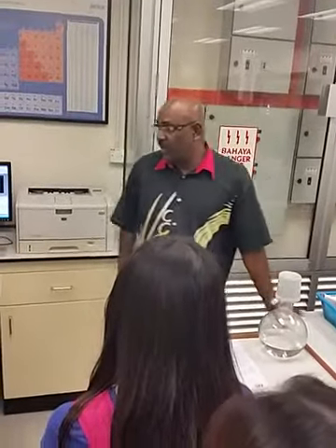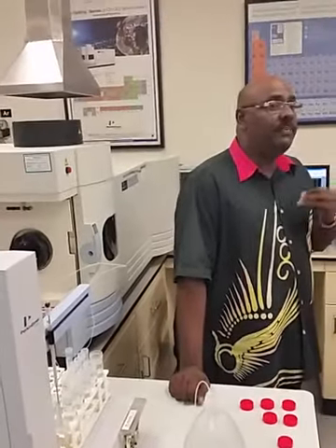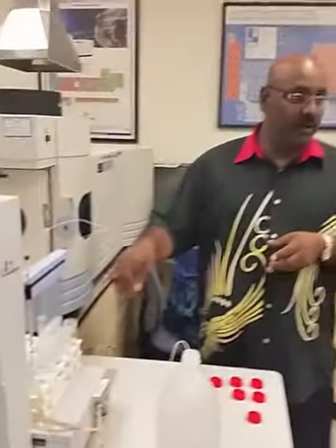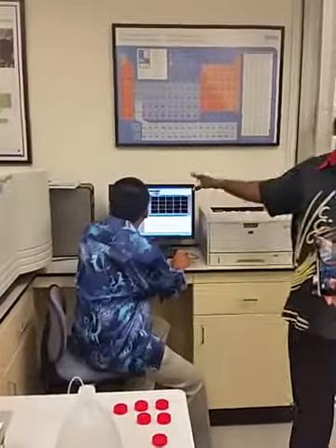Now, this ICP OES is very simple. We do not need to do any sample preparation because normally we receive groundwater samples. Groundwater samples are normally very clean, or surface water. If it is surface water, we just do a simple filtration only. After simple filtration, we put in all the standards. Then we start operating the machine. Based on the calibration standard, we know the machine is running well. So we can start doing analysis. We have to program all your analysis here.